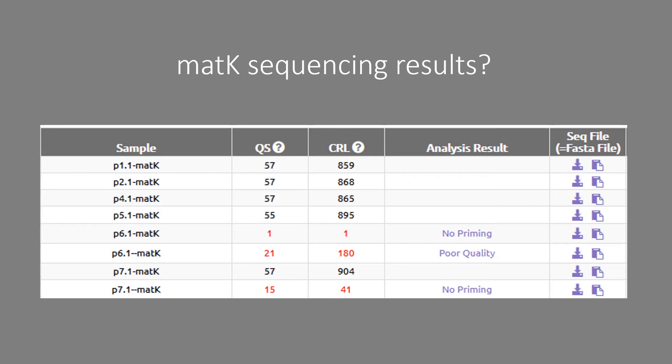Bringing in the MATK sequencing results at this point: they worked for plants one, two, four and five very well, but when I BLASTed them they weren't really very similar to what I thought the plant was. There was maybe a top hit that agreed with the RBCL results, but the other top hits were really not close at all.